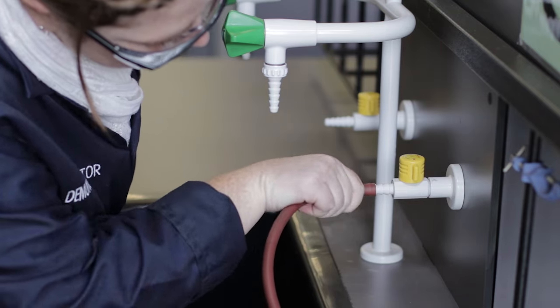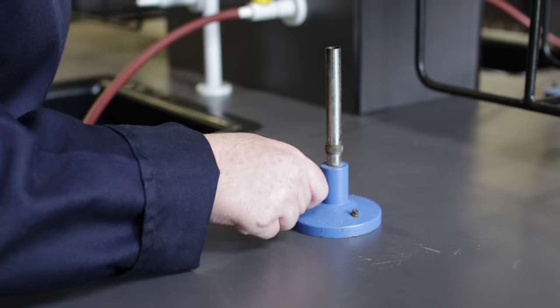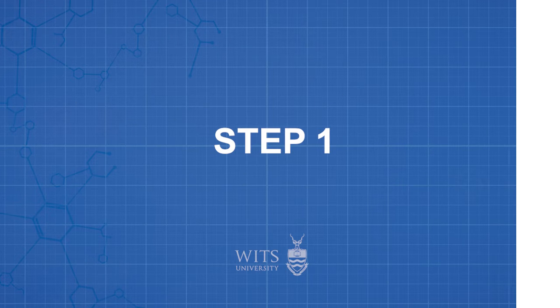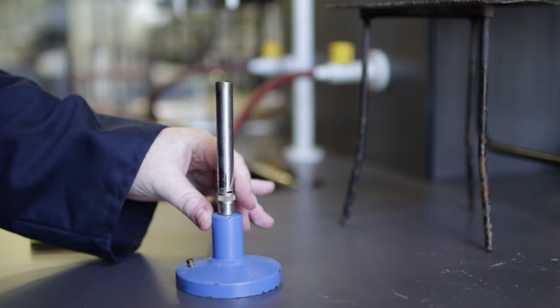Check that the tubing is properly connected to the gas supply and to your Bunsen burner. The following steps will guide you through the correct method of igniting a Bunsen burner. Step 1: Close the air hole by rotating the collar.